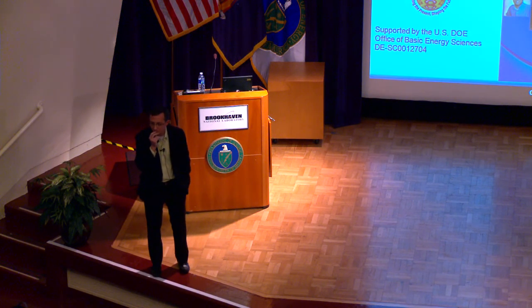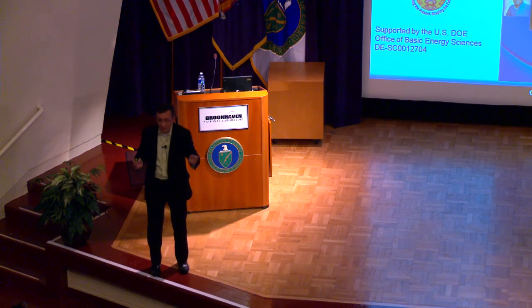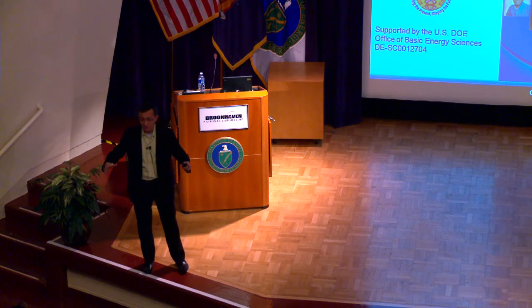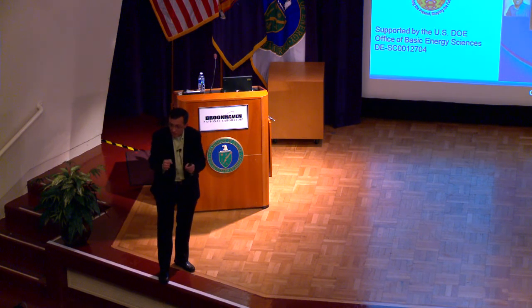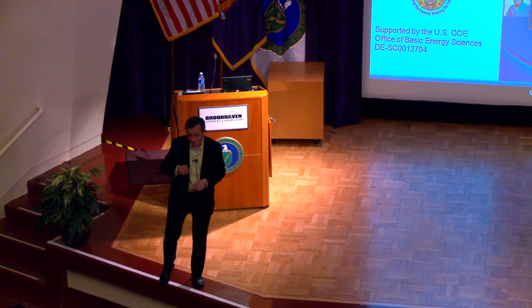So the system is dynamic. What we can do with our in situ techniques is to try to see the most abundant domains that we see, and then we try to simulate and see which sites are the most reactive. Now what this is telling you is that you may see that you have crystalline oxide and crystalline particles, but then under reaction conditions you can have these very small nanoparticles that are dynamically created, and in fact we have done the study of the catalytic CO oxidation.